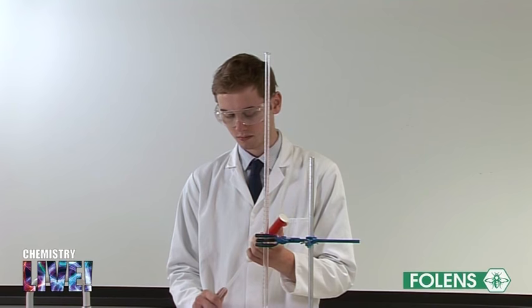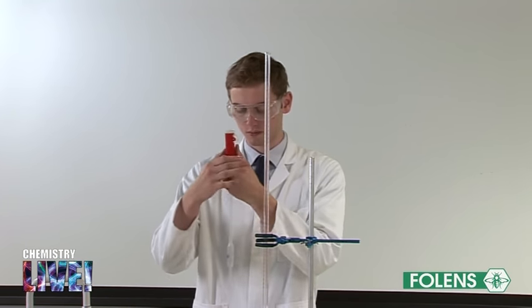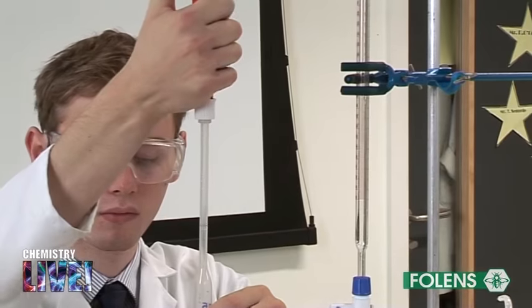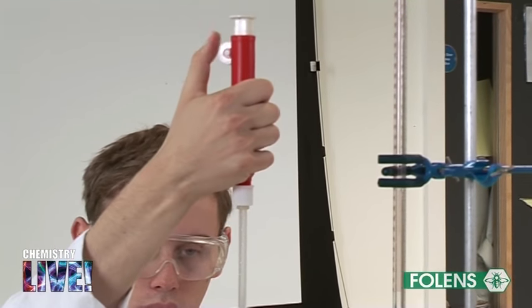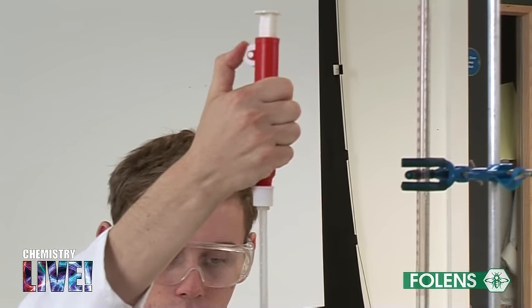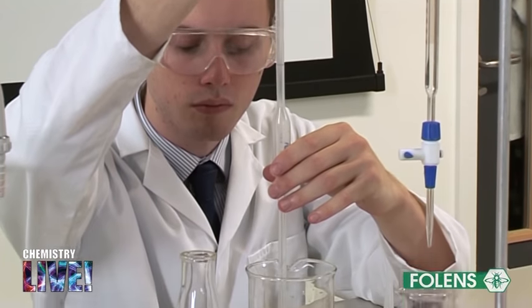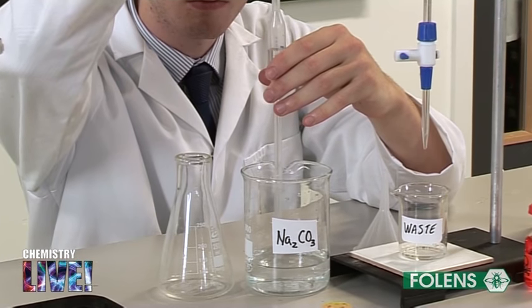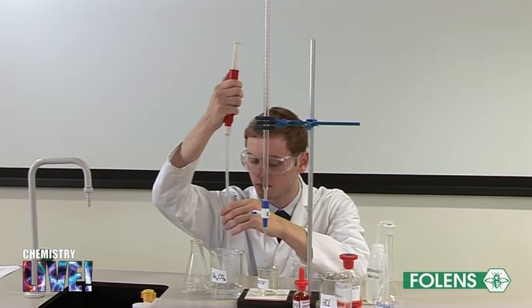A pipette is filled by drawing the solution into it by suction. The liquid is drawn into the pipette above the graduation mark etched on its surface. This is done using a pipette filler. It would be bad practice to pipette directly from the volumetric flask, as any impurities on the outside of the pipette could contaminate the entire solution of sodium carbonate. Hence, this is the reason why you first pour the sodium carbonate into a beaker.